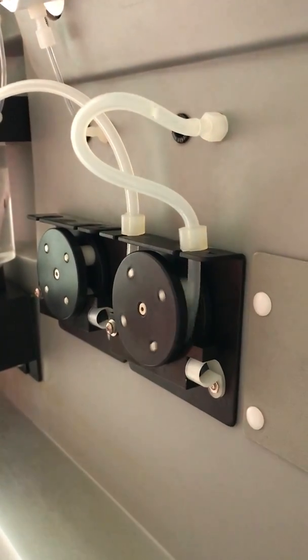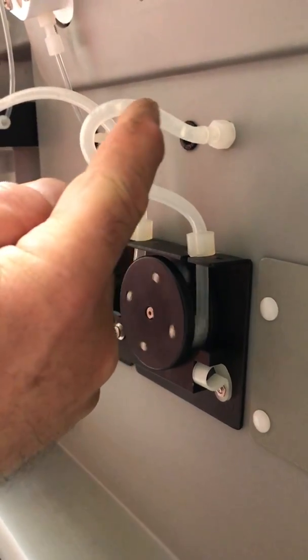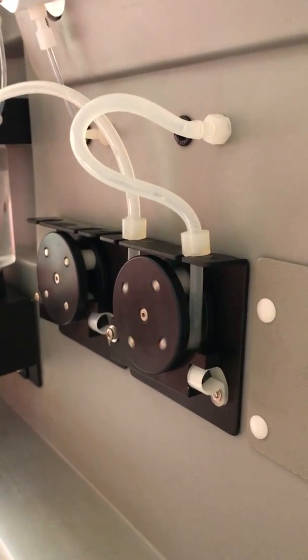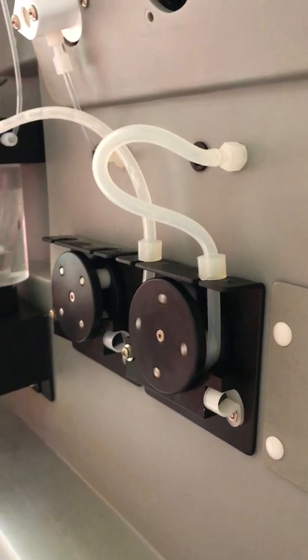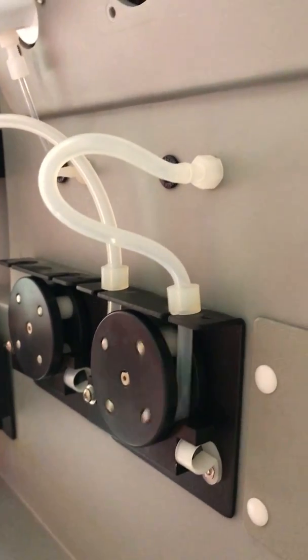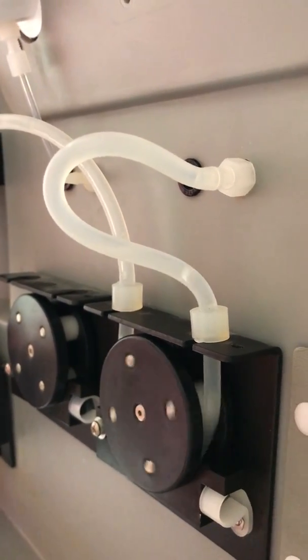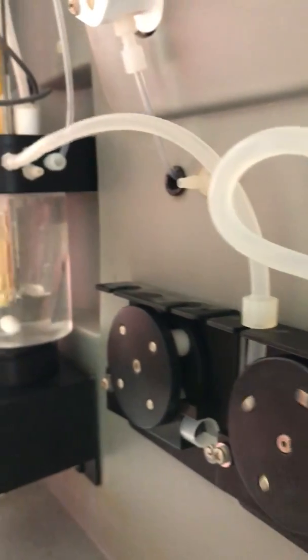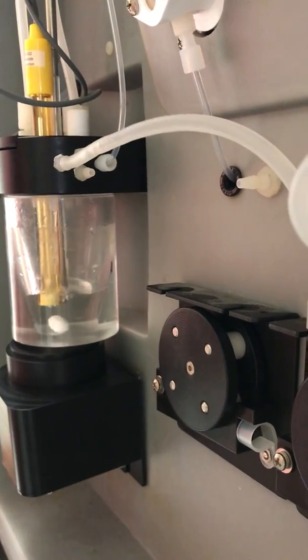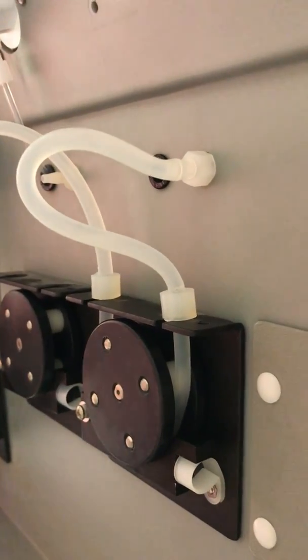There's liquid coming up. I put the straw in the water. If you look in here, you'll see the liquid coming up. Take a little bit to get it. It's a long tube coming out the bottom of the analyzer. And there it is, I think. Solid slug coming through, going over, and coming into your cup. I'll stop the noise so you can hear what's going on.